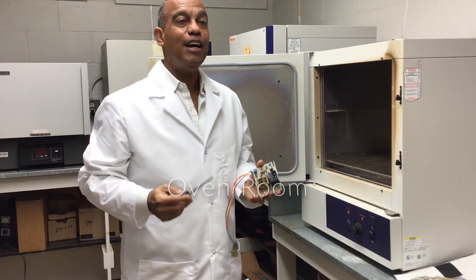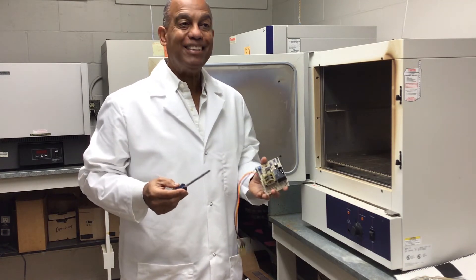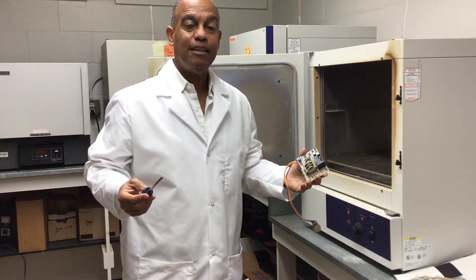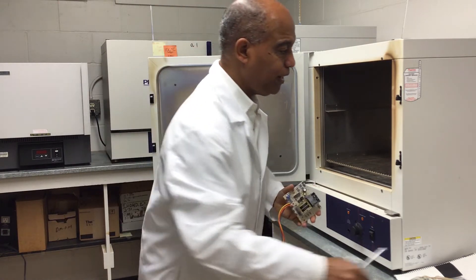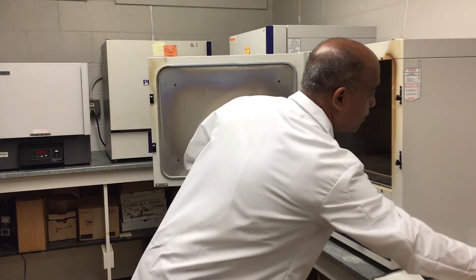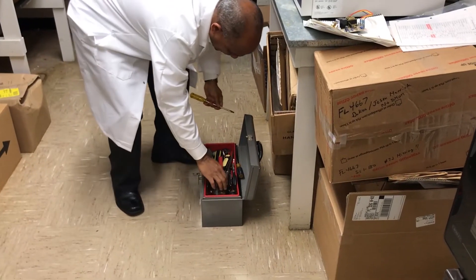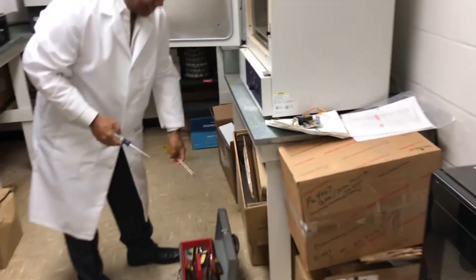We're currently in our oven room and we have an oven problem — talking about maintenance. This piece of equipment stopped working, and we identified the issue: it is a controller. We identified it thanks to the manual, which allowed us to find the part number. From the part number we were able to order the part, and now we can use our toolbox to open up the equipment and replace the part to get it going again.